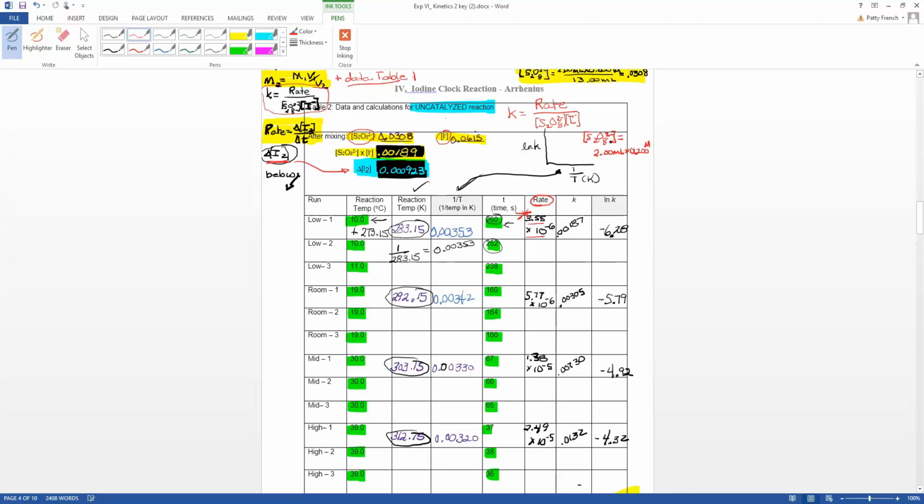That's the concentration of persulfate, divided by the total number of milliliters, which was 13.00 milliliters. Now my milliliters cancel, and this does in fact give me 0.0308 molar. So that went in right here.